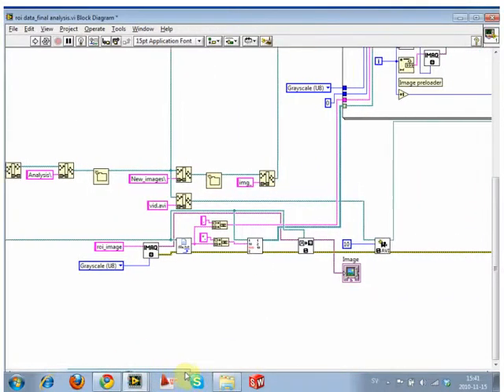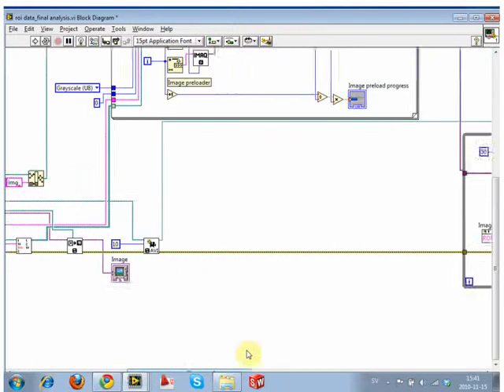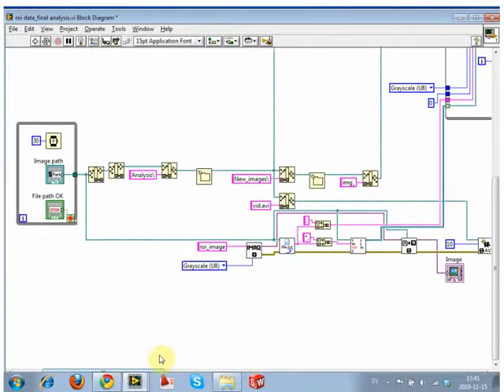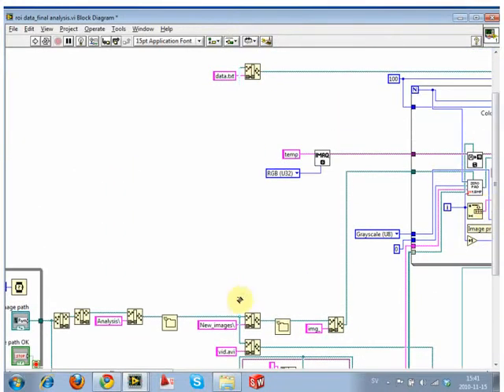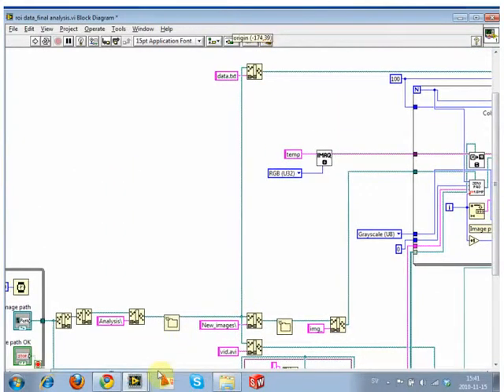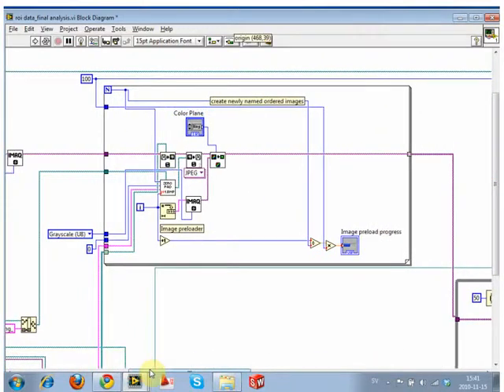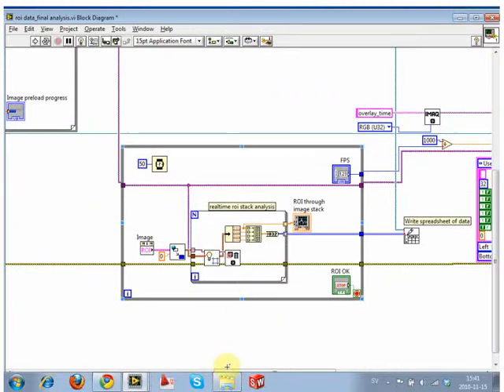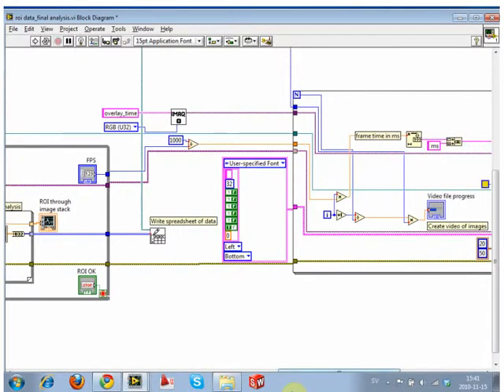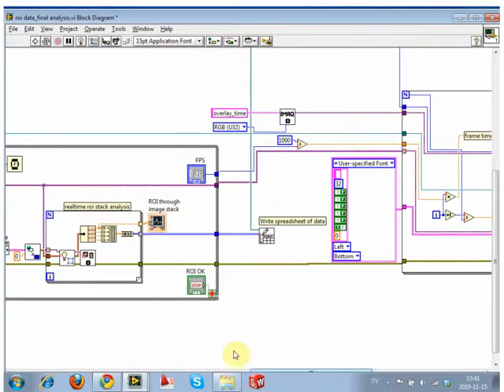Sorry, that's okay. So like I was explaining to start, we've built most of this previously. Open a file, kind of show it, do some ordering. Image preloader. This time the image preloader is saving the files as well as ordering them. ROI analysis exactly the same as done previously. Then we're going to make a video file, do a simple text overlay, and then look at the outputs.